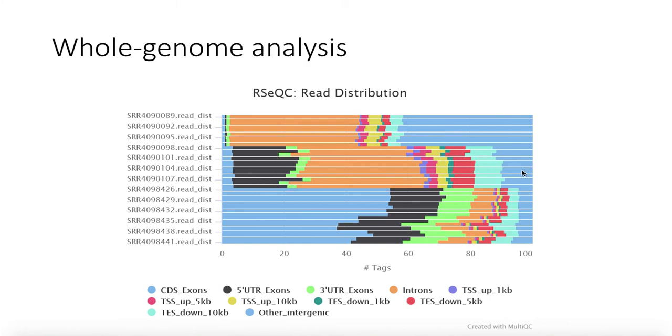And you can see you get a lot more over exons, which is all right, it should pick those up. You still get that intergenic. You get more over these 5' UTRs. That makes sense too. So a lot more whole genome coverage. Bottom tracks here is RNA-seq, right? So you get tons of exons proportionally. This is all percentages, by the way. So this bottom track is percentage, not total number of reads. So this is a little misleading.